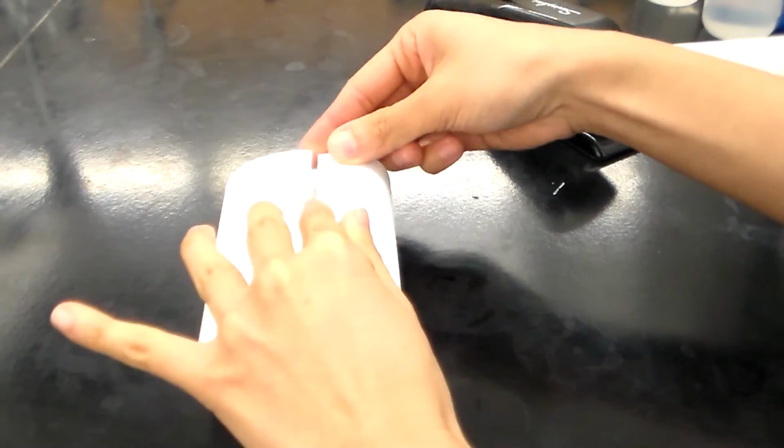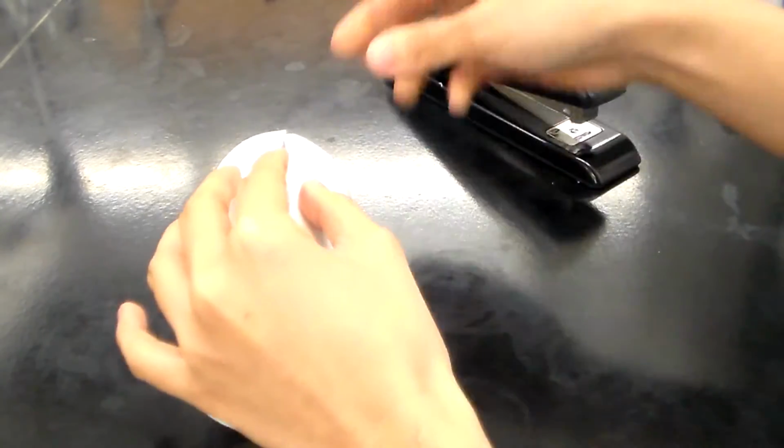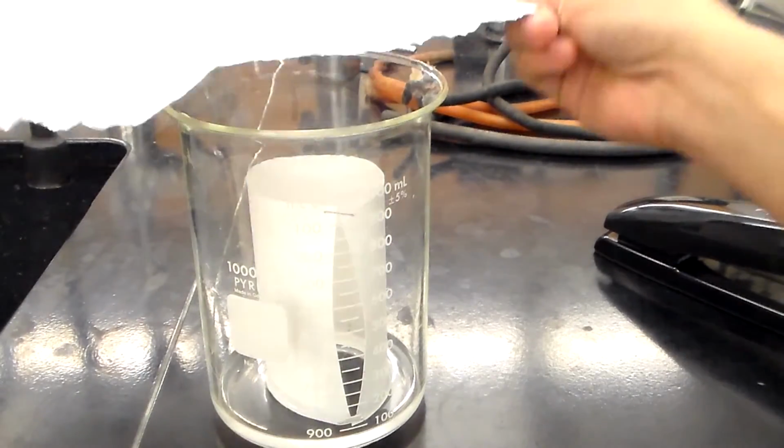Roll the chromatography paper with the spots on the inside. Staple the edges near the top and the bottom. Stand the paper with the pencil line down inside the chamber. Cover and wait for about 30 minutes.